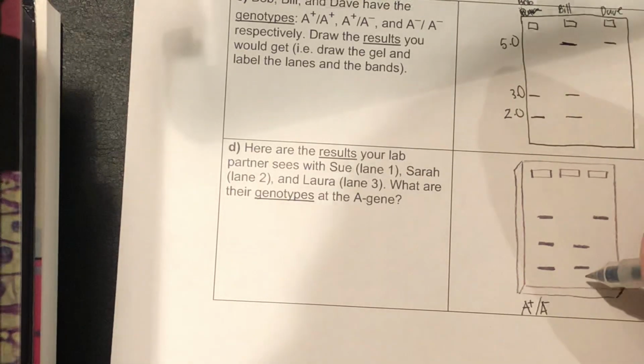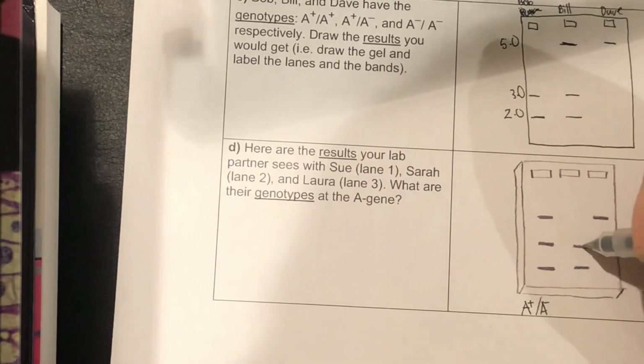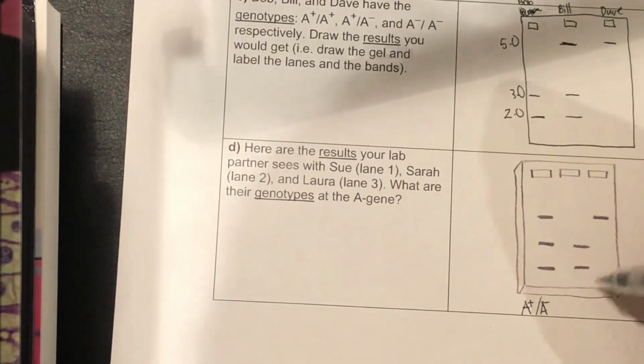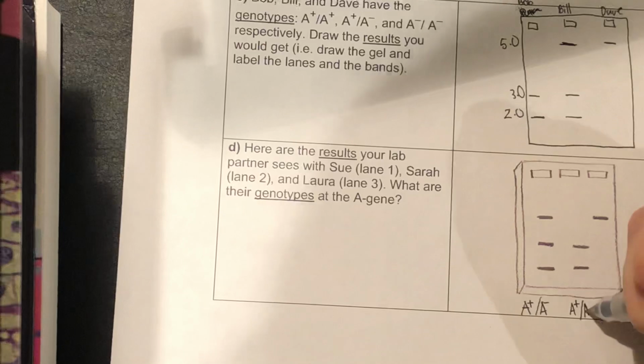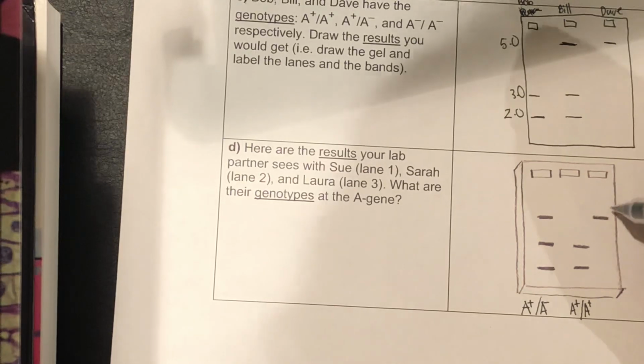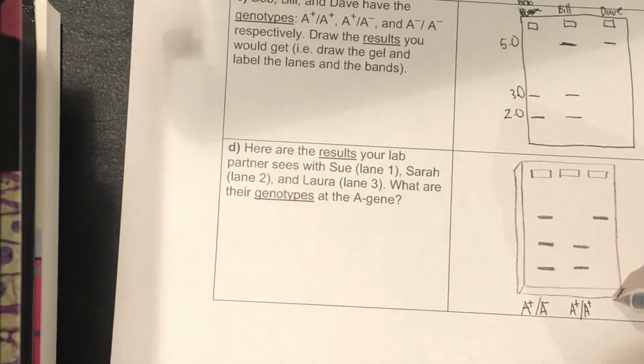For Sarah, what we see is bands at 2 and 3 kilobase pairs, but we don't see any at 5. That would tell us that she probably doesn't have any of the mutant alleles, and so is homozygous for the A+ allele. And then finally, Laura only has a band at 5, and so what that would tell us is that because she doesn't have any functional alleles, she would be homozygous for the A- allele.